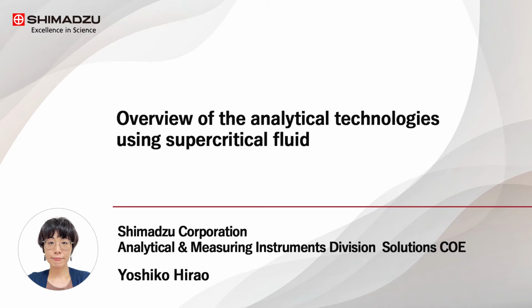To promote sustainable development with consideration for analysis, we should develop analytical methods that include the ideas of green analytical chemistry. We believe the method using supercritical fluid carbon dioxide can contribute to achieving it. I'm going to explain why the analytical technologies using supercritical fluid carbon dioxide may give a new method for green analytical chemistry.